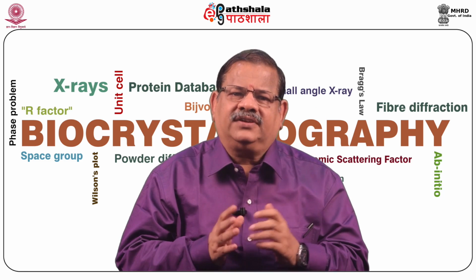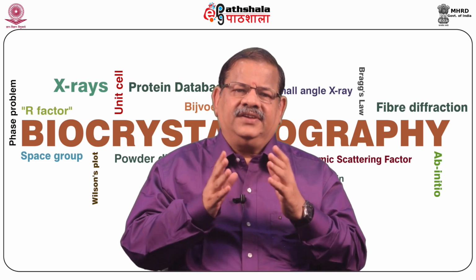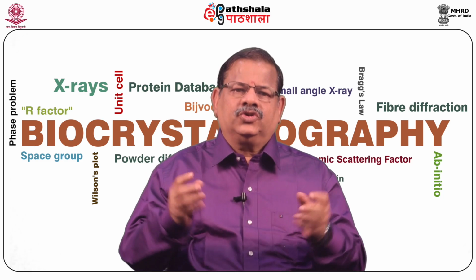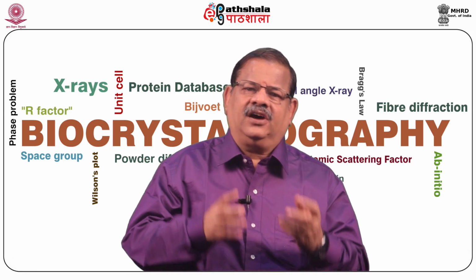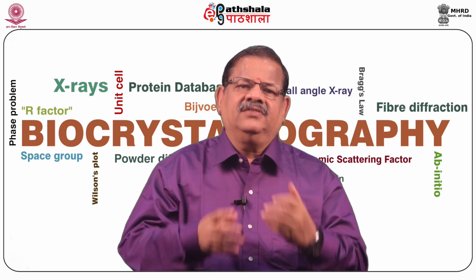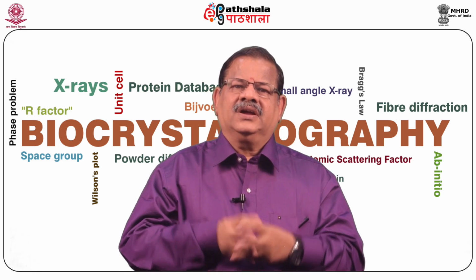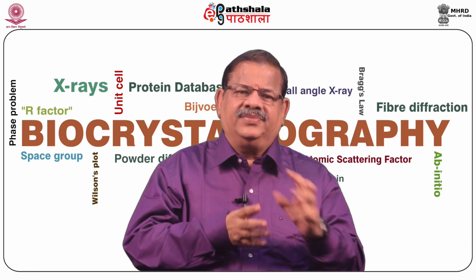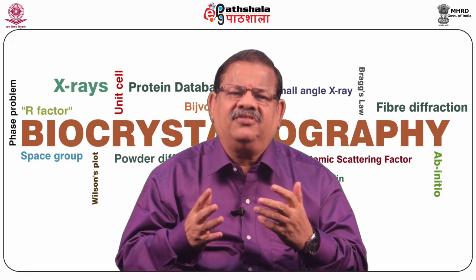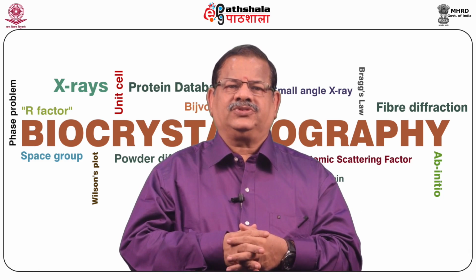The other powerful alternatives are the single wavelength anomalous diffraction SAD technique with native anomalous scatterers like sulfur or phosphorus, or soaking experiments with halides or iodine combined with MAD or SAD experiments. In the above methods, calculation of phases from these heavy atom sites is most important. Although Patterson maps are very useful in the above calculations, direct methods have also been proposed.